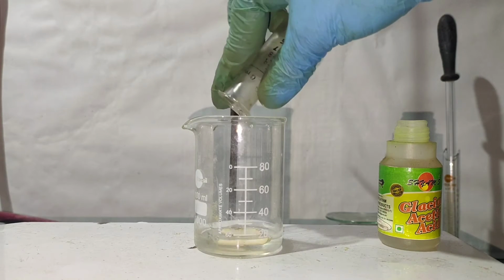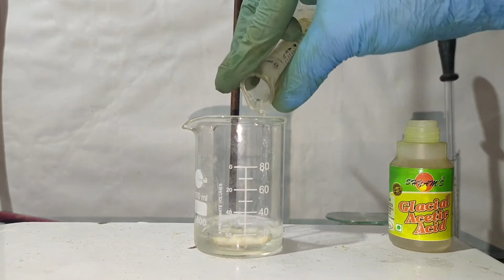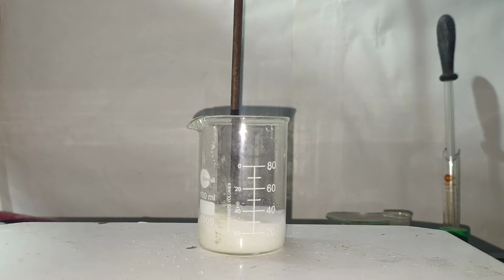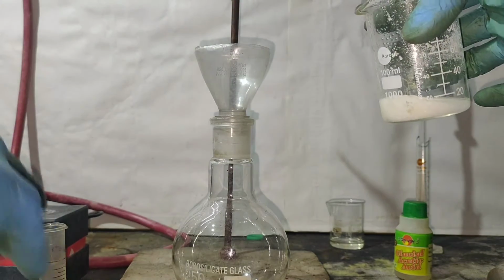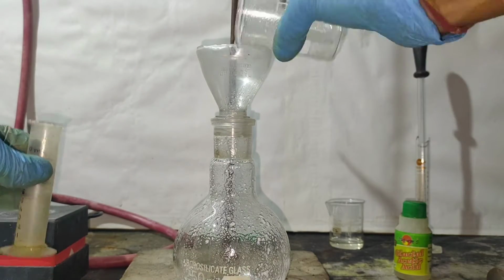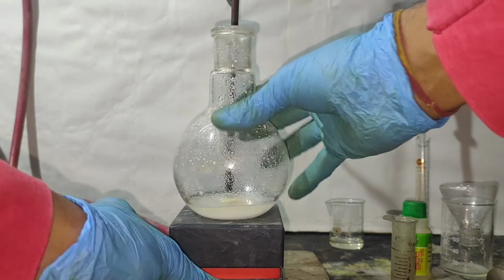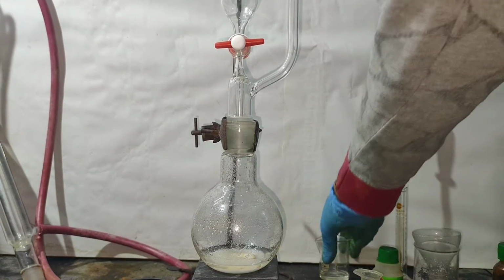Then I took 15 ml of glacial acetic acid in a beaker and then to it I added 5 grams of crushed naphthalene powder and stirred it. The naphthalene did not dissolve in acetic acid, so I decanted off 10 ml of acetic acid and transferred the suspension to a flat bottom flask. The decanted acetic acid was used to transfer the stuck naphthalene into the flask. Then I placed the flask on a magnetic stirrer and placed a stir bar in it.